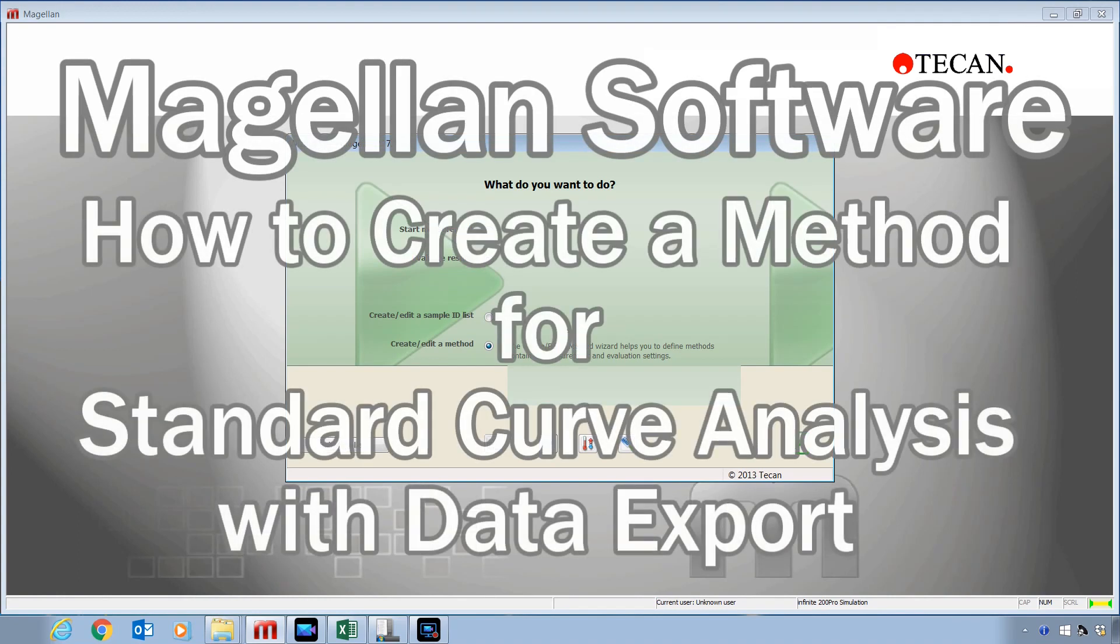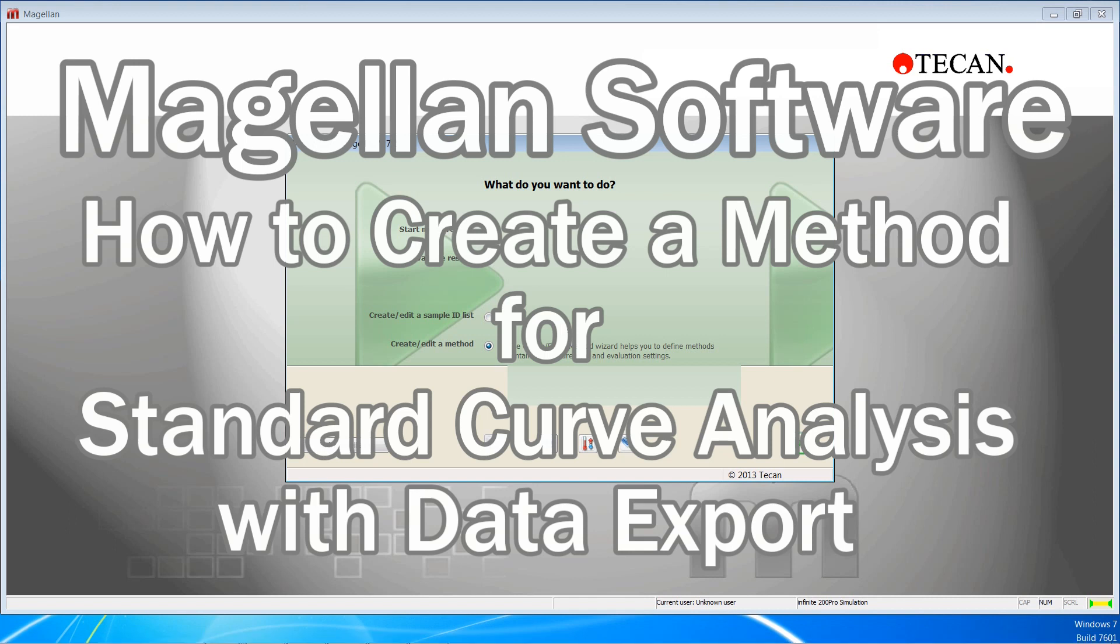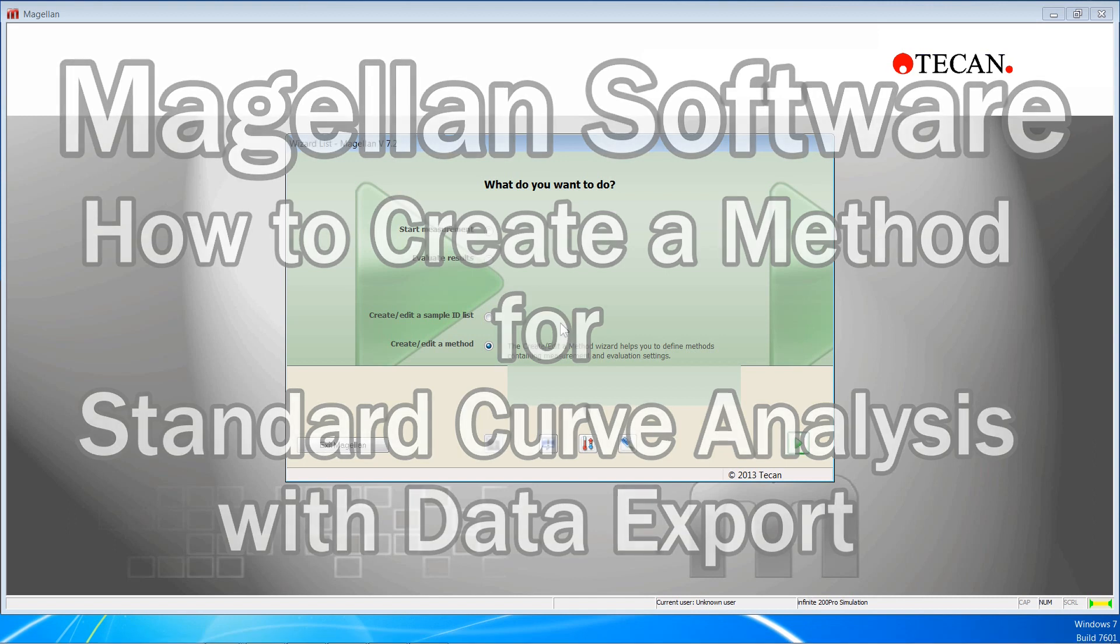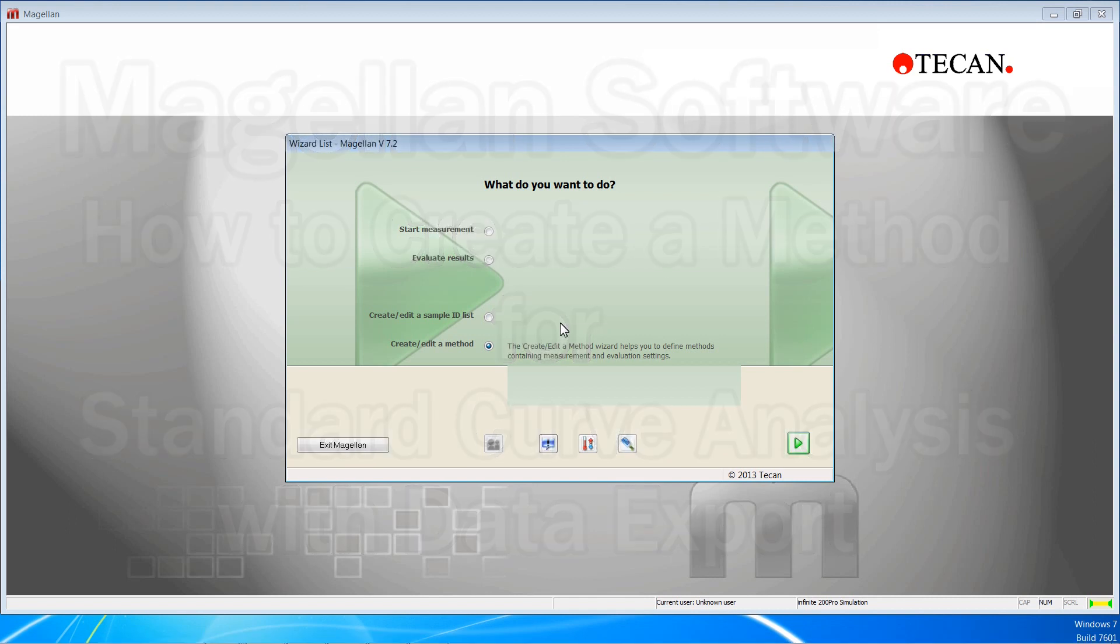Hi, this video will show how to create a method for microplate assay data collection, standard curve analysis, and data reporting with TCAN's Magellan software.